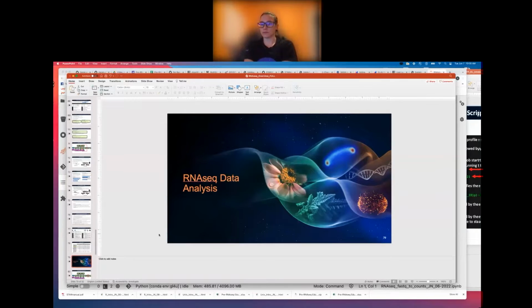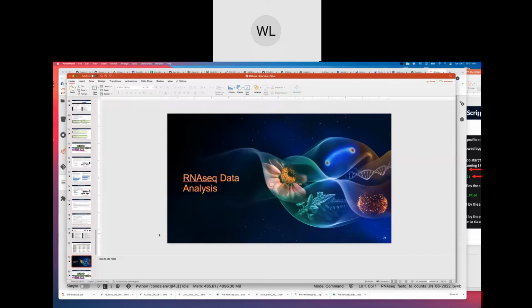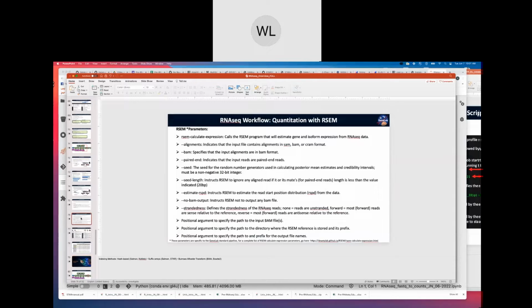Amanda, I have a question. So all this data recorded are counting both sense and antisense. Ideally, it sounds like you should count only the sense, but our data have a majority in the antisense. So how can that be happening, and how do they solve this problem?